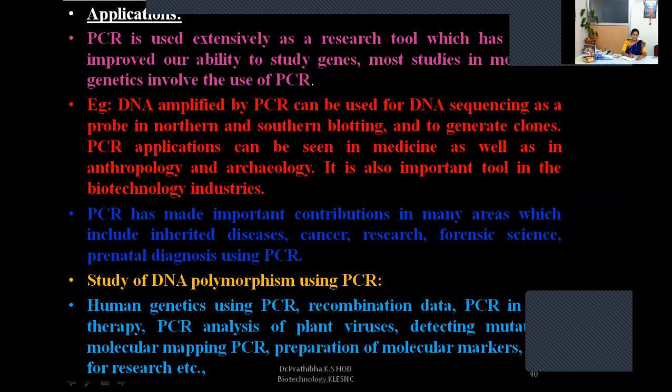In the laboratory, the collected VTM, the viral transport medium, will be subjected to nucleic acid extraction. They extract RNA with various chemicals, and later that will be subjected to RT-PCR. RT-PCR is nothing but reverse transcription PCR. Why do we name this RT-PCR?